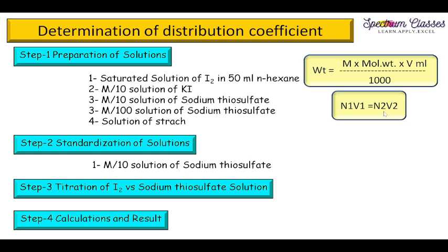Here I have written N1V1 is equal to N2V2. Since sodium thiosulfate molar solution is equal to normal solution, therefore I have written over there this equation, normality equation. Fine. Now we are going to start the lab activity.